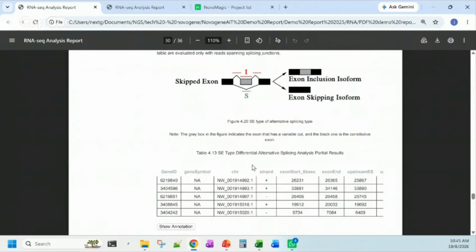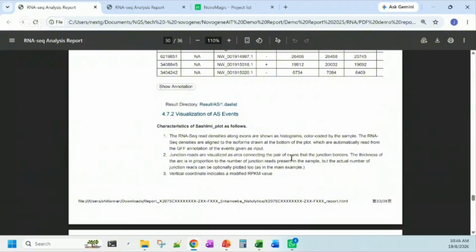Normally, this one will be interesting to look at, but it will be put as secondary, because with short read sequencing, sometimes we are just guessing how many exons are there and how the exons are connected to one another, and only then we try to compare different isoforms. Most of the time, the gene expression will still be the focus of RNA-seq projects.